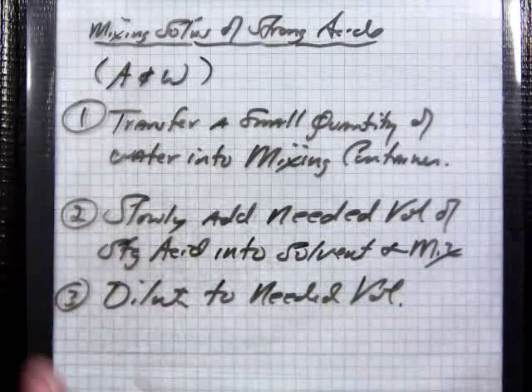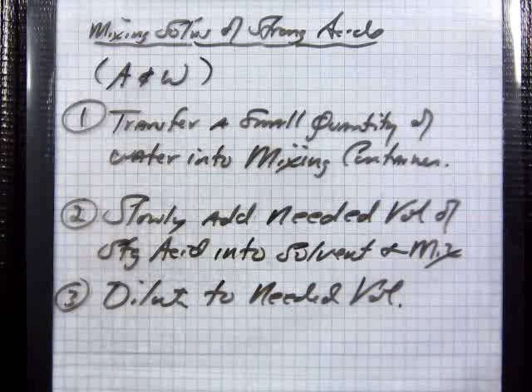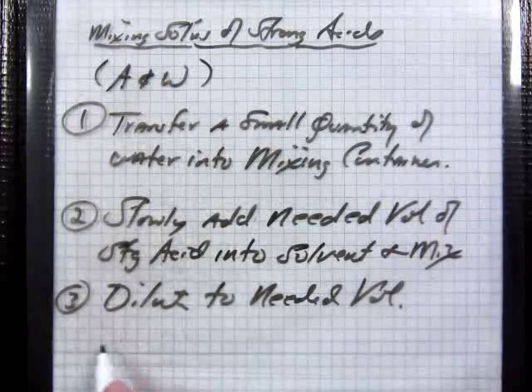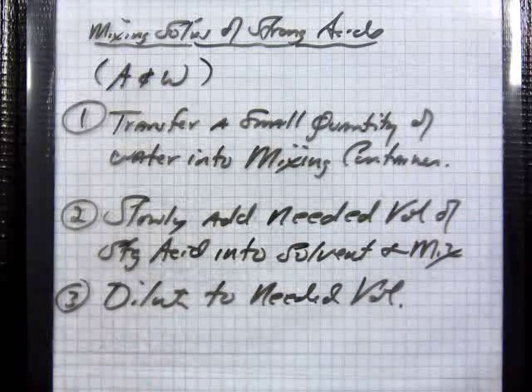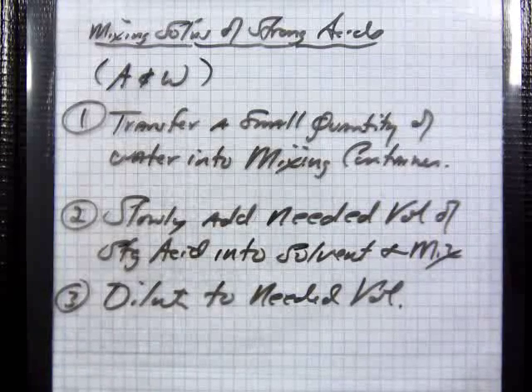So in the preparation we're talking about, we came up with 21.9 mils. So we need 500 mils. I'd say probably put 100 mils of water in the mixing container.